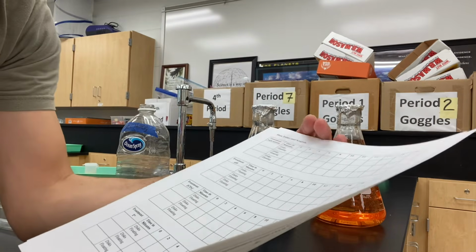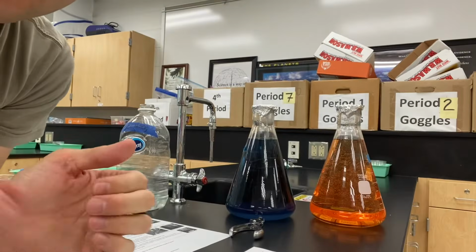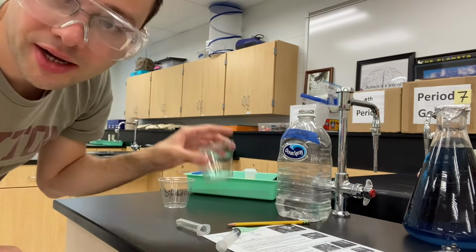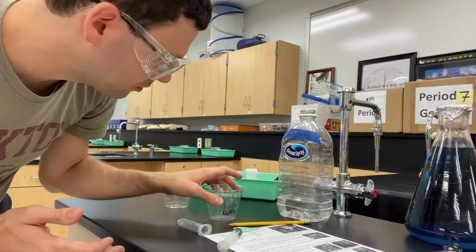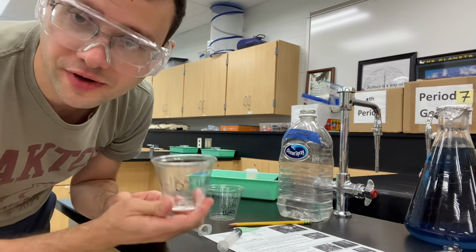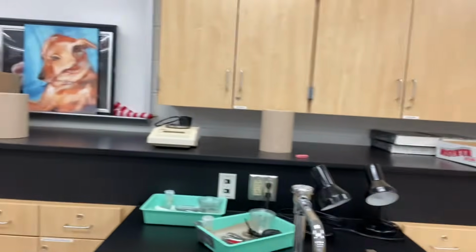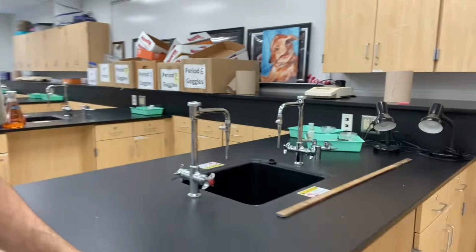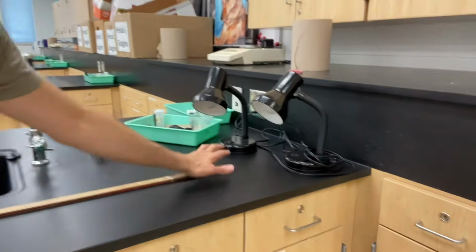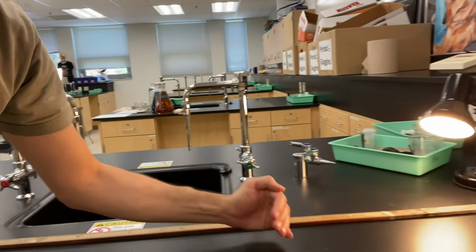If you're one of the groups doing temperature, then you will be placing your cups either on ice for cold, you're gonna leave them out for room temperature, or I'll give you boiled sodium bicarbonate solution for hot. All right. Finally, the last groups are the groups that are gonna do distance, so light intensity. If you're a light intensity group, you're not gonna put your cups over in the trays at all. Your station is gonna have lamps over here that you'll go ahead and turn on, and you'll put your 3 cups at different distances to manipulate light intensity.